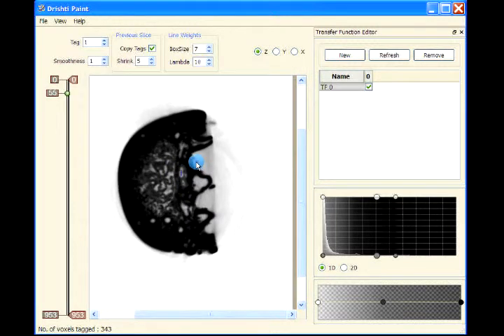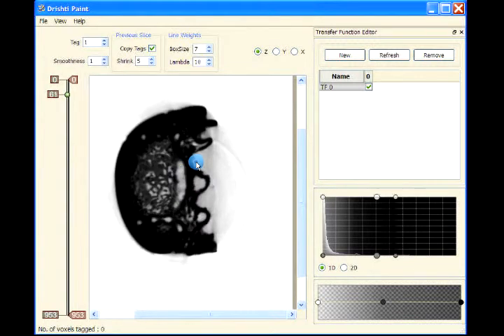Tag here. So we are right at the end, and then we can start tagging. That should be fine. Tag here. We can just add in a bit here.